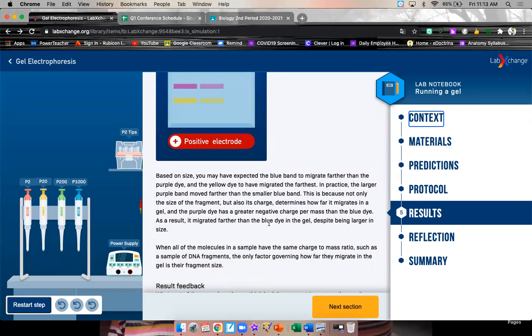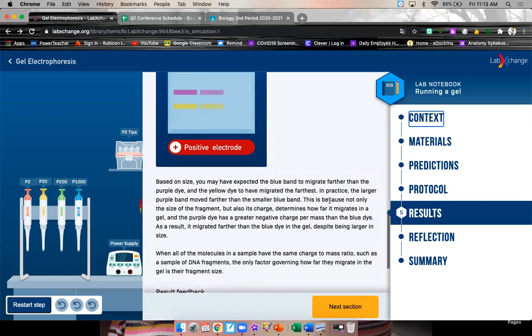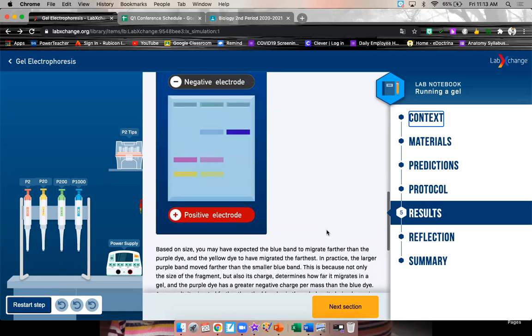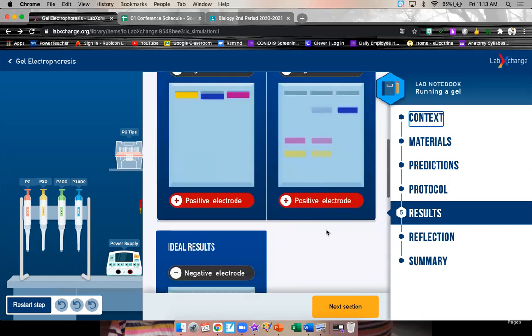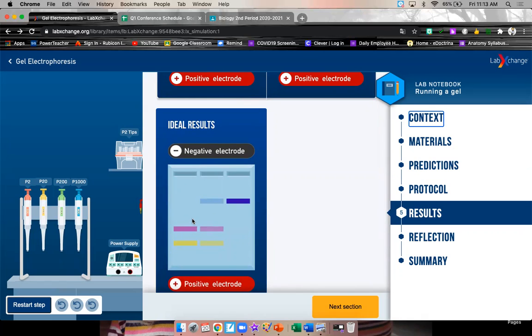Based on size, you may have expected the blue band to migrate further than the purple dye and the yellow dye that migrated the farthest. In practice, the larger purple band would move further than the smaller blue band. This is because not only the size of the fragment, but also its charge determines how far it migrates in the gel. And the purple dye has the greatest negative charge per mass than the blue dyes. As a result, it migrated further than the blue dye in the gel, despite the larger size. So, even though purple was bigger than blue, it had a stronger negative charge. So, it had a stronger pull toward the positive side.